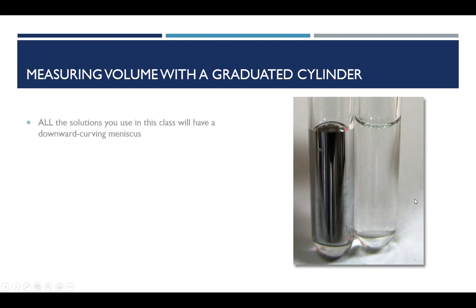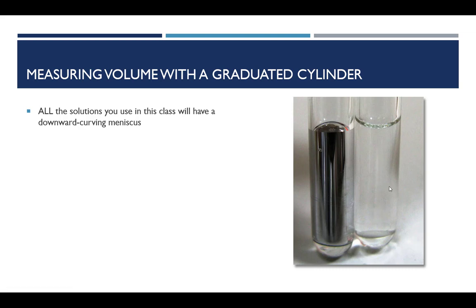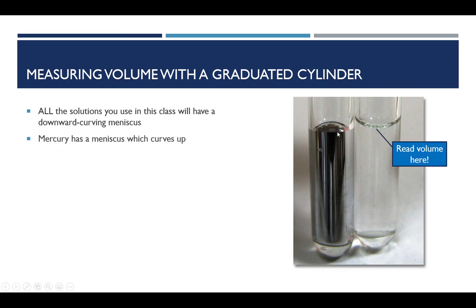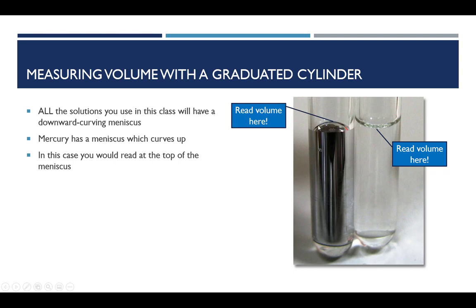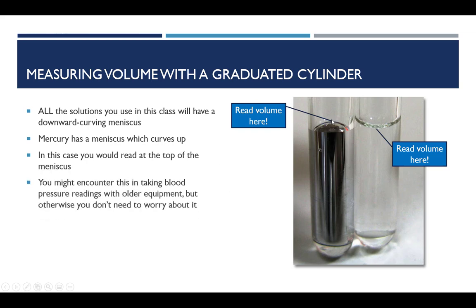Over to the right you see something interesting. What we have here is water — it has a downward curving meniscus. But over here we have a different liquid: liquid mercury. Mercury has a meniscus which curves up. So you would actually read at the top of a meniscus if it did curve up. The actual rule is you always look right in the middle — if it curves up, it curves up at the center and that's where you read; if it curves down, it curves down at the bottom. It's not likely you will see mercury, since we try to avoid it, but there are older blood pressure devices which do use it.